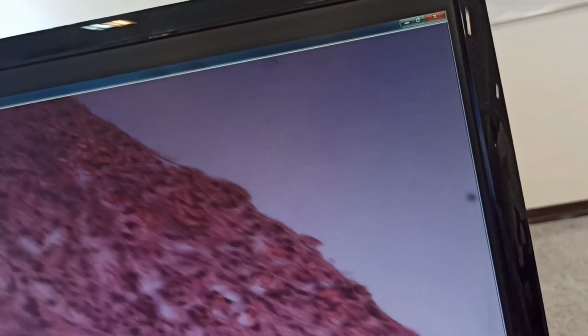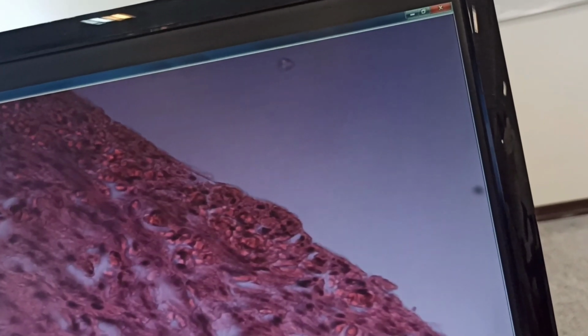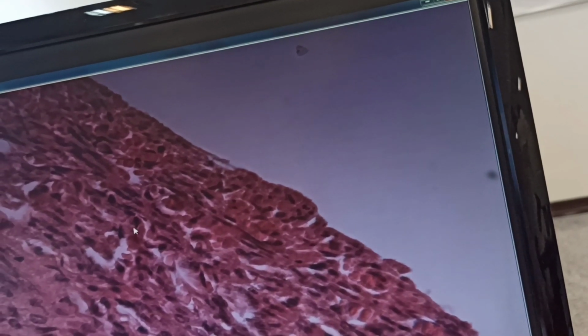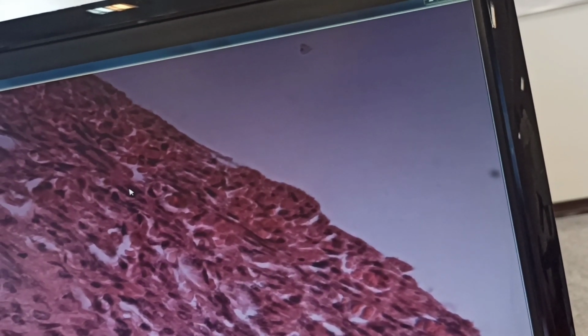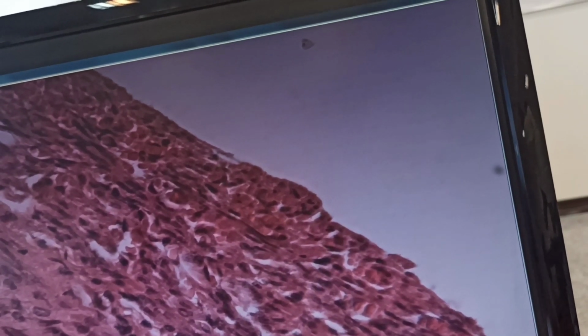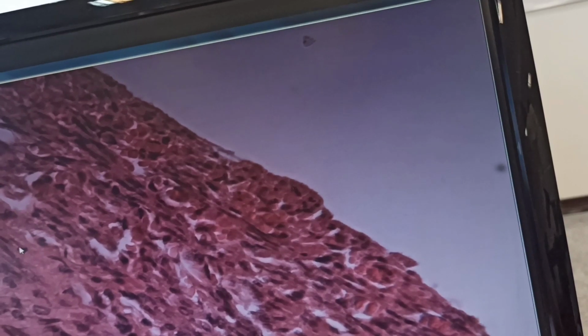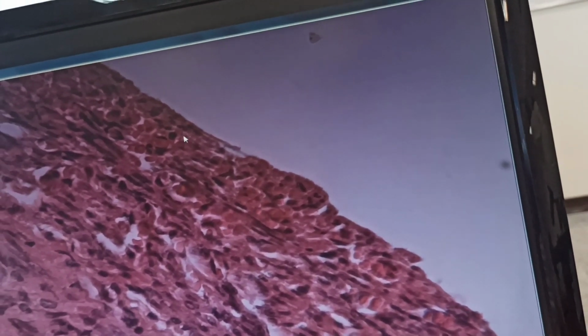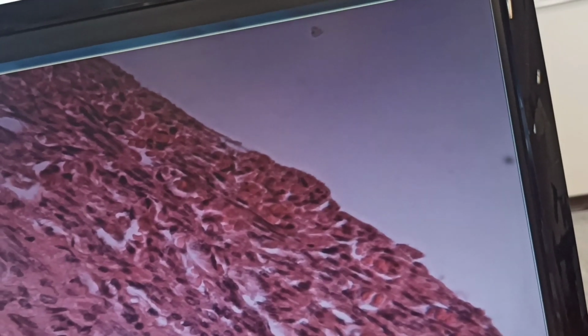I continue to the outside again. Connective tissue outside is the perimetrium. These are the fibroblasts, with dark nuclei. These are the smooth muscle cells, light staining. Compare these two nuclei: fibroblast, smooth muscle cell. So this is the perimetrium, and from this part, the myometrium.